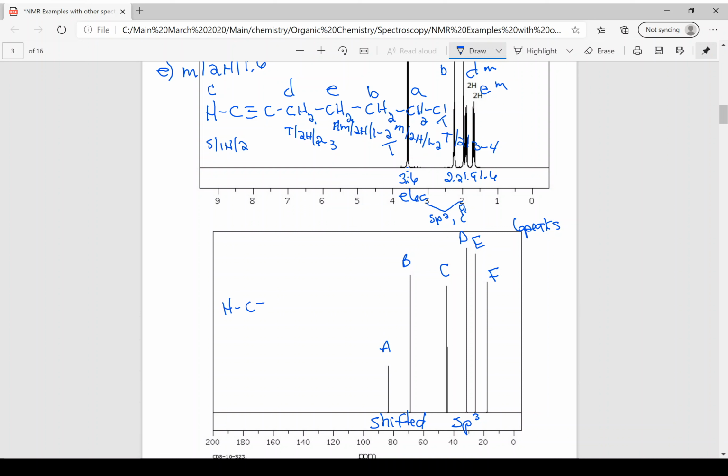All right, let's go to our carbon 13. One, 2, 3, 4, 5, 6. Notice I didn't write the hydrogens in this one except the ending. Your choice. On the proton NMR, you should write the hydrogens, but on the carbon 13, your choice. All right, so who shifted down the furthest? All right, now we get to take a note here. Do I think that the 2 alkynes are the furthest? Or do I think one of those carbon next to the chlorine is the furthest?